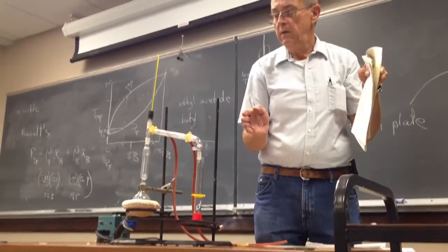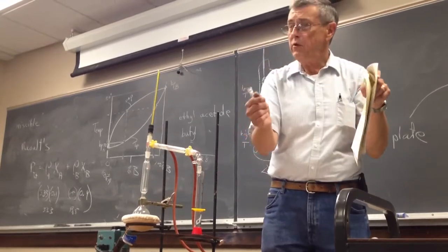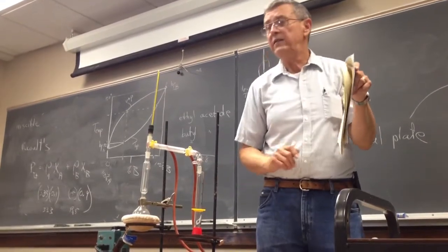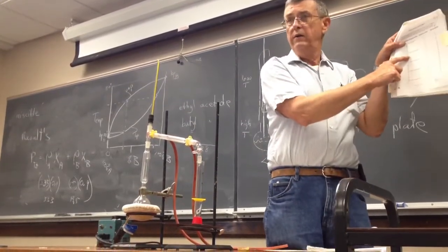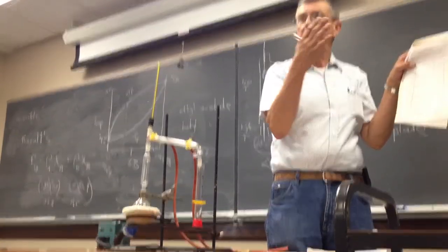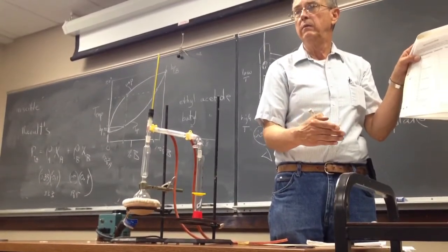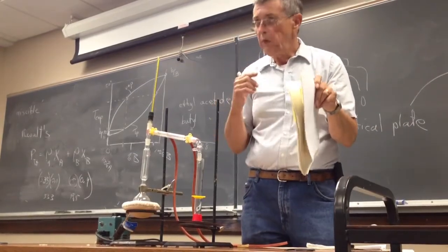FB. And I collect its 2 mils, and I write that temperature down. And then I put this back over. It still has 10 in it. Collect 2 more. It now will show 12. And I write the temperature. So this is what you want to follow, and you write the temperature at the end of each 2 mil collection. Okay? Do that in your head multiple times.